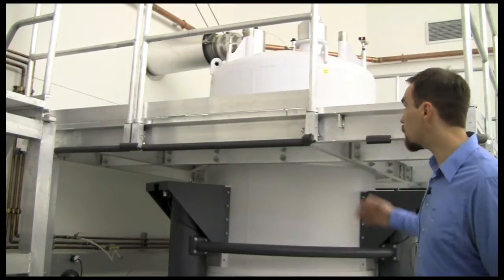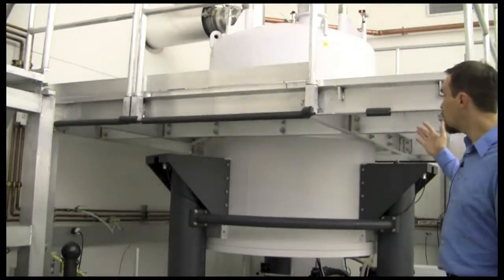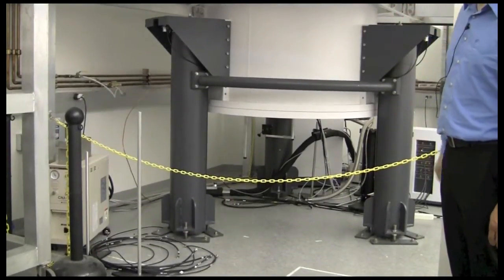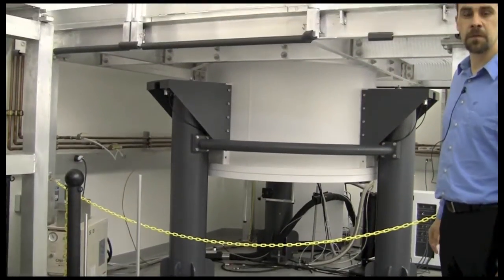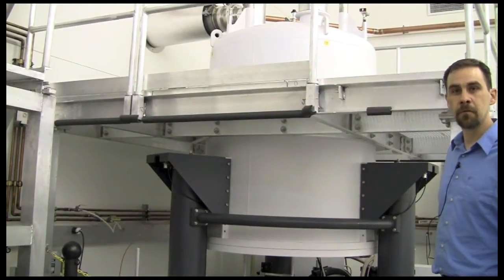For this, I'm going to use our largest magnet, which is for our 800 megahertz NMR spectrometer. It is a superconducting electromagnet where the main coil is at 4.2 degrees above absolute zero, and the main magnetic field is 18.74 Tesla.